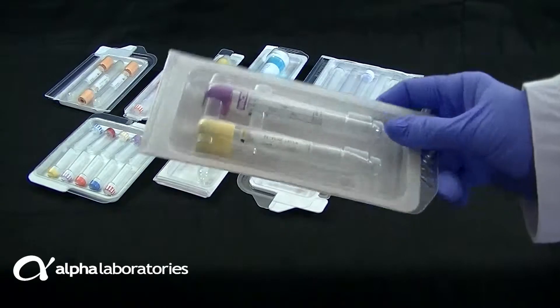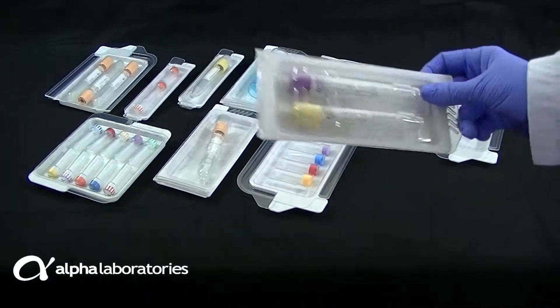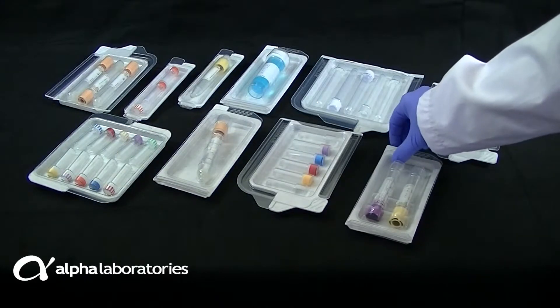When your sample is placed inside the appropriate Specisafe, the hard shell protects the primary container from knocks or falls during transit.